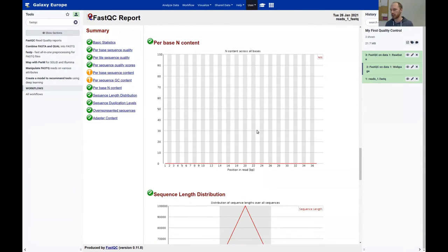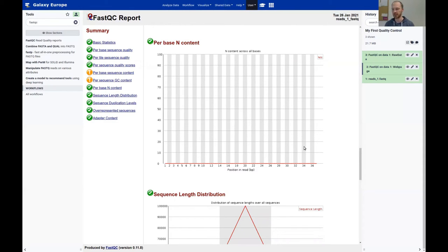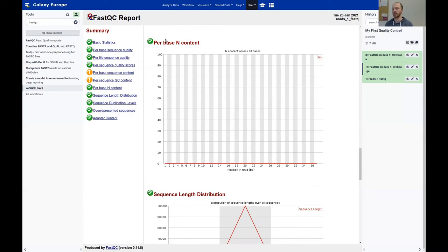Then the per-base N content — it's perfect, we have no Ns in there. As I mentioned in the theoretical part, an N is a base call where the sequencer or algorithm cannot decide between A, T, G, or C, so it writes an N instead. The x-axis shows position in the read and the y-axis shows the fraction of reads with N at that position. Here it's zero — perfect.